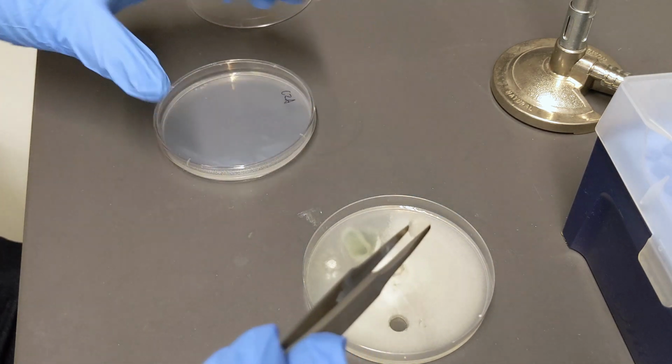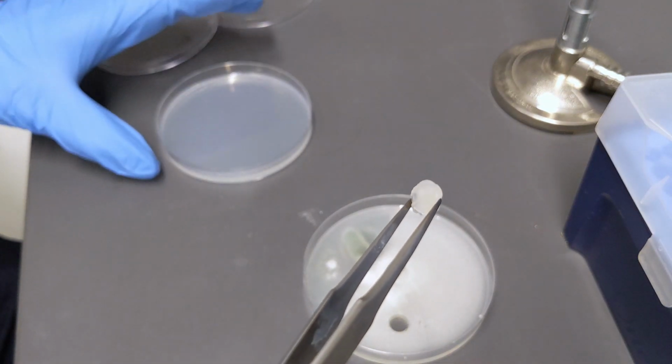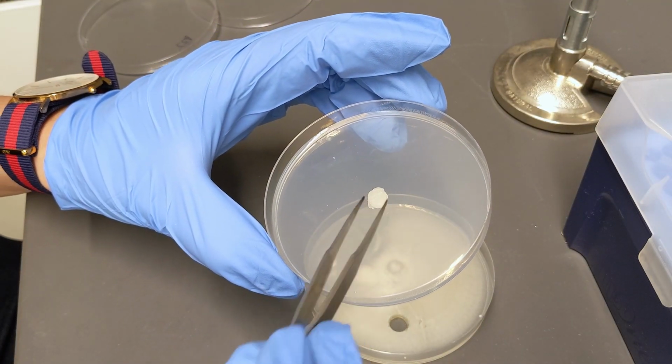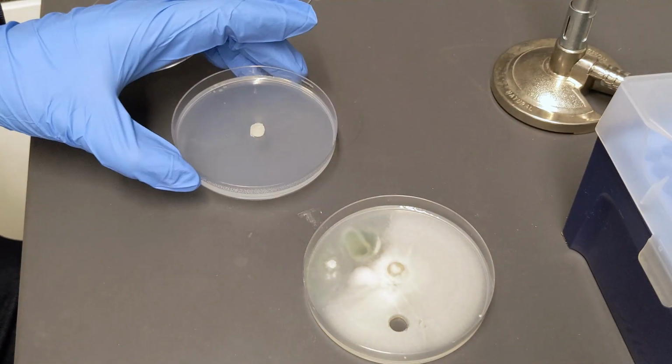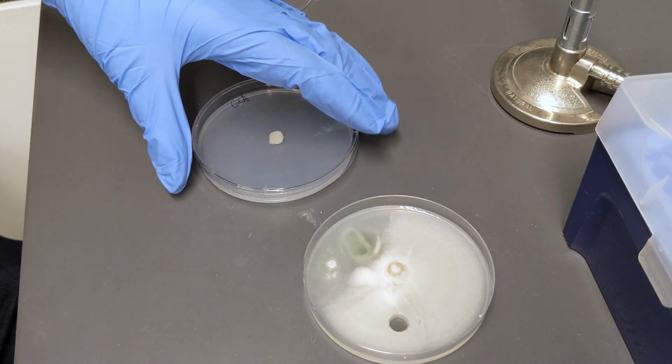Next, we leave this piece of agar upside down to ensure those spores are able to seed on the new plate of agar. Finally, we cover the plate and leave it at room temperature, which is P. rubens' favorite temperature.